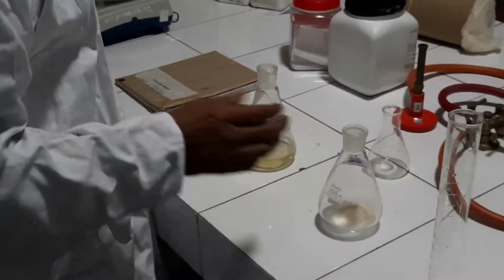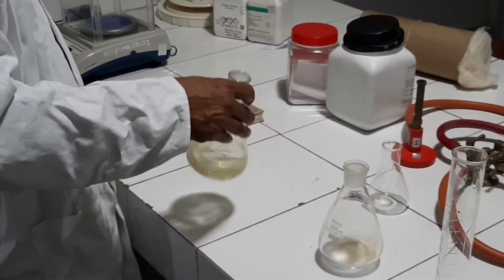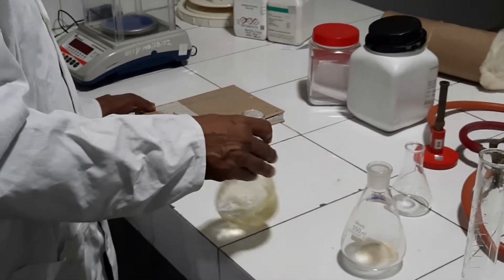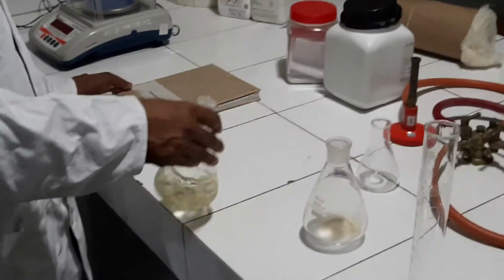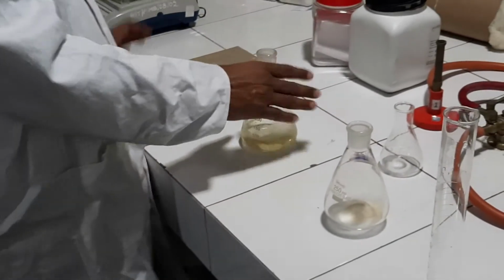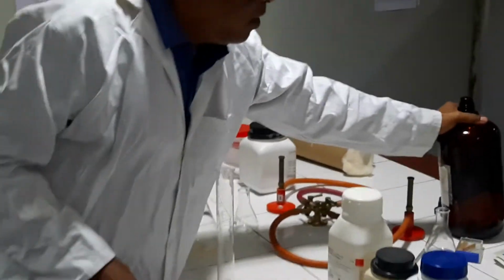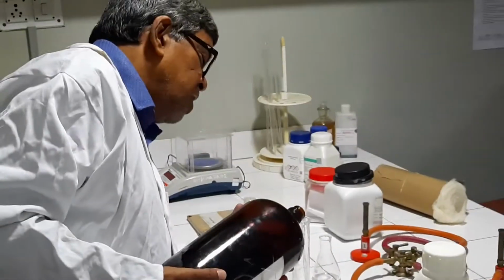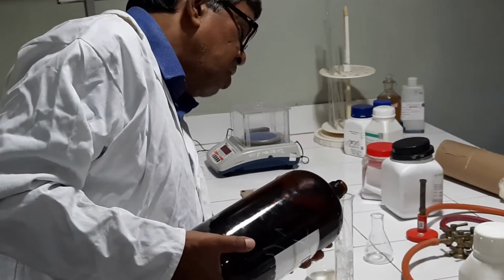Now I am taking the help of swirling. What I am doing is called swirling, SWIRLING. Both directions, but not together, slowly after stoppage, so that there is no spillage. In a microbiological experiment, you will have to keep in mind the possibility of spillage. Spillage.